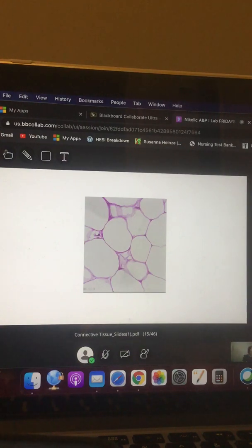Now, let's go ahead and look at this. I actually really like this one. What is that? You can see it's pointed right at it. Nucleus. So you've got to study this, because normally our nuclei, like if you think about the simple columnar, are a really nice circle. It's so big and so pretty. This one is smushed to the side. So you've got to study this so you're not confused by it. So what is that thing? It's the nucleus. Yes, it is.